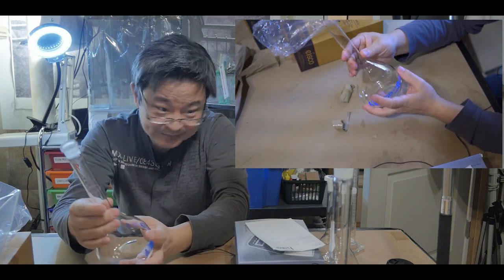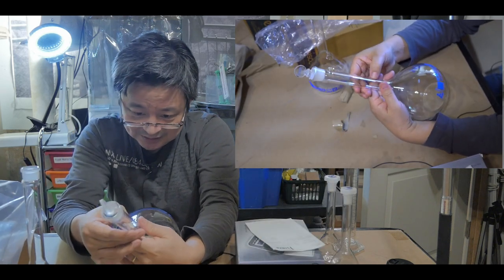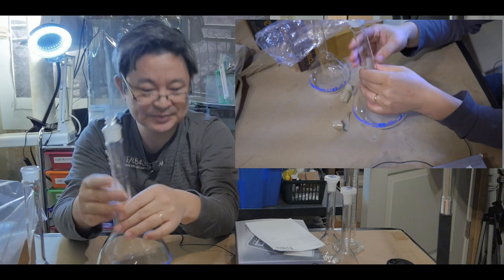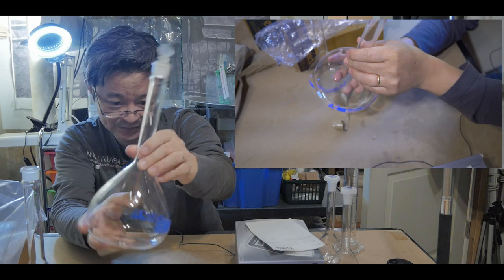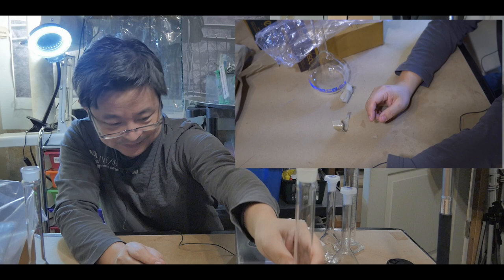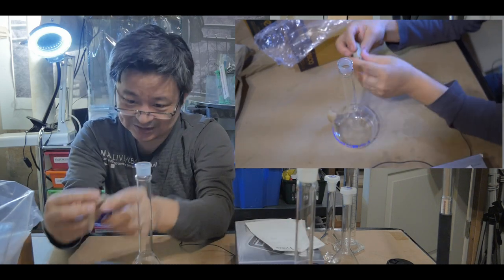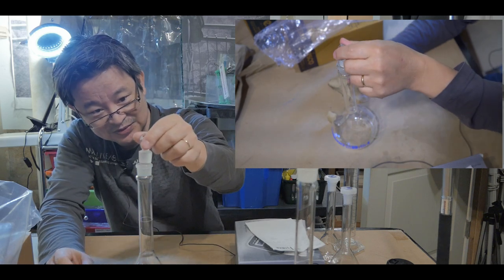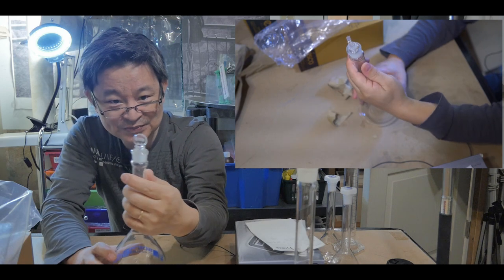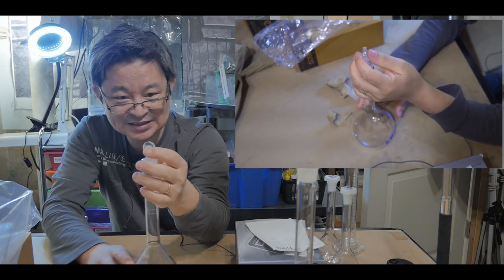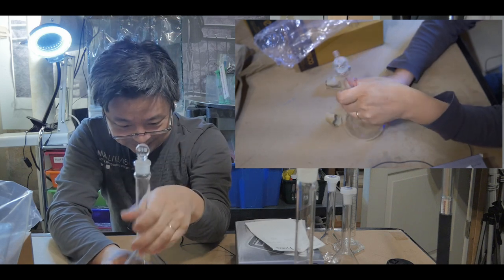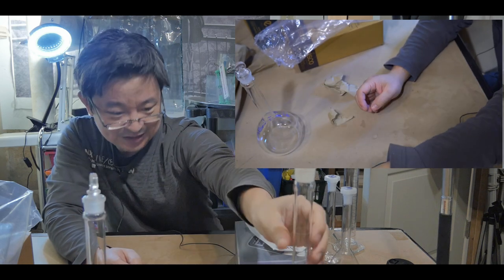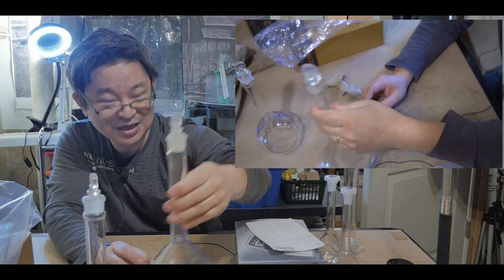Now, of course, you only get lower volume, you only get 500 mils. That's alright, and then plus and minus 0.4 milliliter. This one is actually really nice. There is no scratch on them, whereas this one does have it. I'm just worried a little bit about this one. This is external, so it's okay. Crack, scratch here as well. Okay, I got to be careful with this one, but it's alright. You know what, for the price I'm paying, this is not bad at all. Scratch here too. I guess that's why it's a Class B. This one, wow, looks like brand new. It's beautiful. Oh, you know, I guess you're not going to always get the best. I can always ask to return it, but I think it's too much work for me. Oh, this one - yeah, love it. Wow. They did say it's $22. They say $19, $19 for just this, I guess so. But this comes with this, and again, it's only 10 bucks. Wow, this one $19. Okay, this one is $22, but I bought it for half that price. Okay, very good.